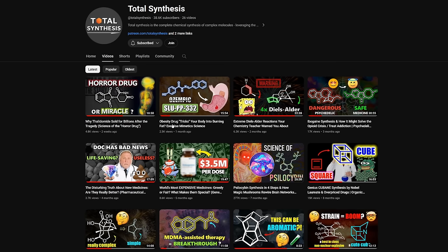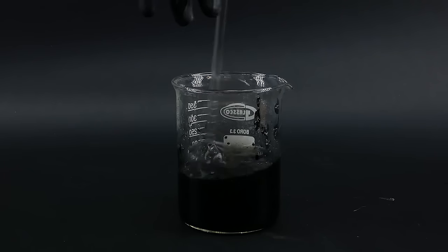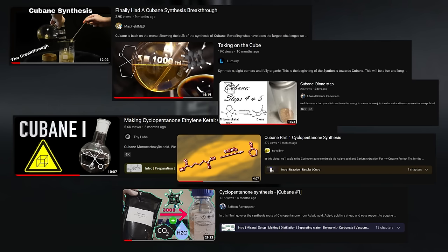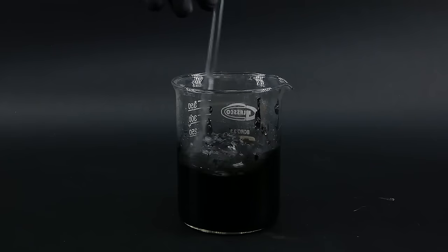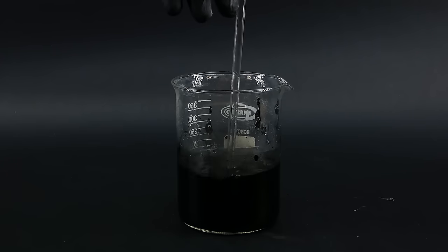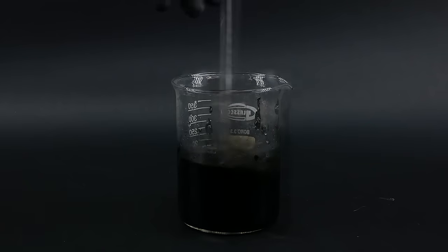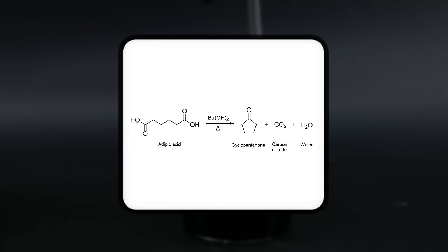If you want to see what cubane can be used for, you can head to the Total Synthesis channel, which has a few good videos about it. I also highly recommend watching other channels' cubane synthesis videos, because some really good progress is being made, and it's great to see so many people try to make their own cubes. Now I can begin the synthesis, and the first step is the catalytic decarboxylation of adipic acid to cyclopentanone.